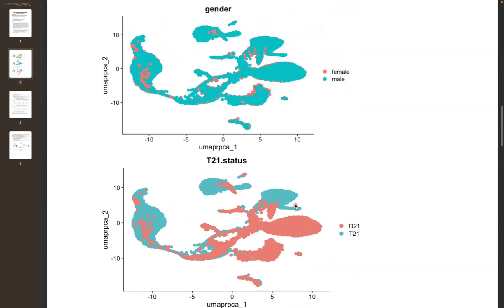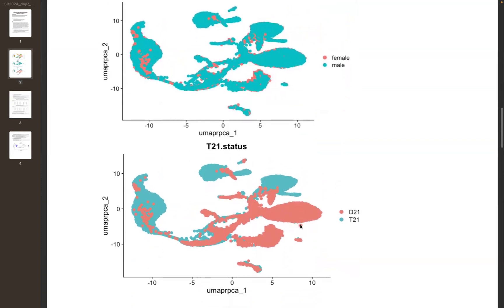It is a little hard to tell because the layering makes it difficult — cells are plotted in the order in which we integrated them. We can see that underneath the big clusters there are actually a lot of teal cells, and behind the red cells are a lot of teal cells plotted underneath. We can change the opacity of the cells to help identify differences like that. Nonetheless, we do see groups of cells that seem to be either from T21 or D21, and some clusters are primarily T21.